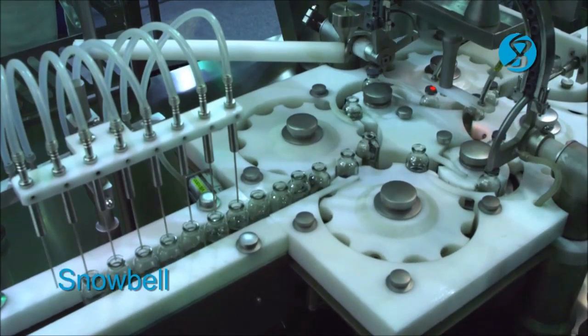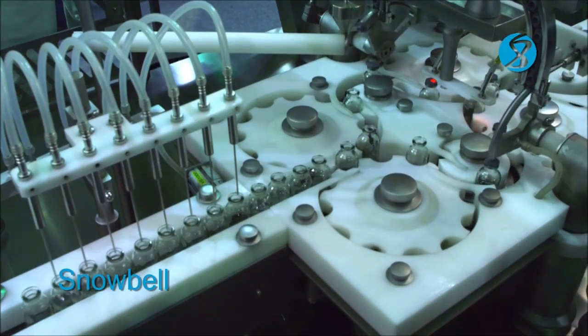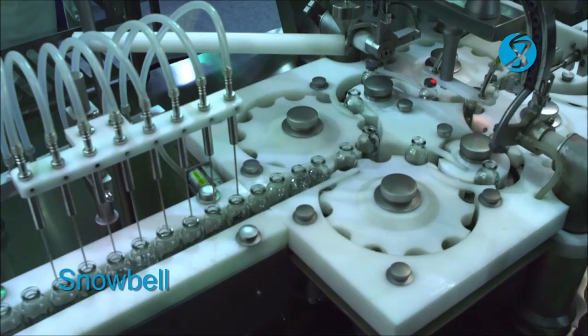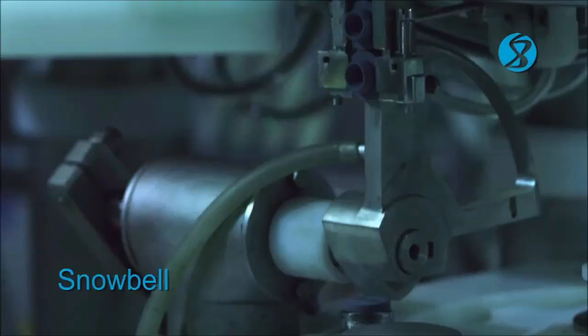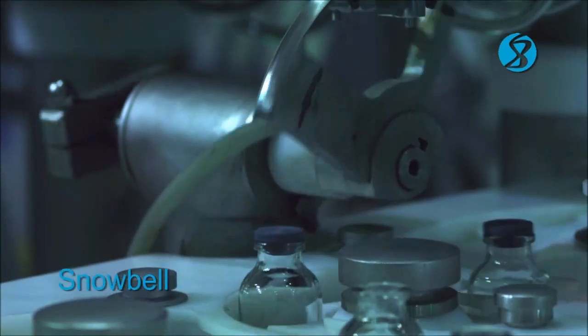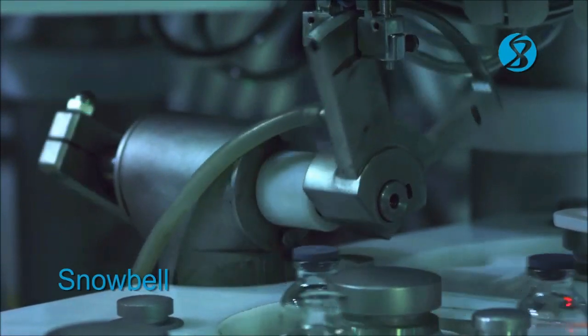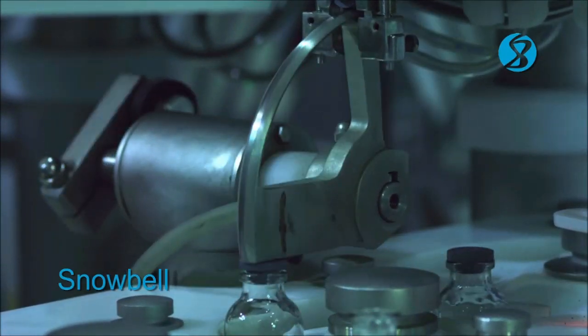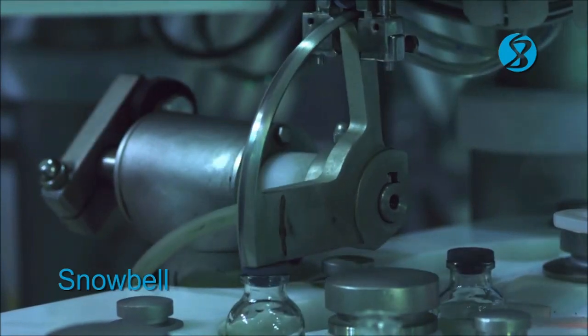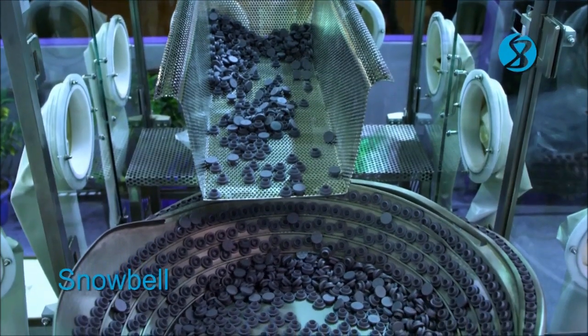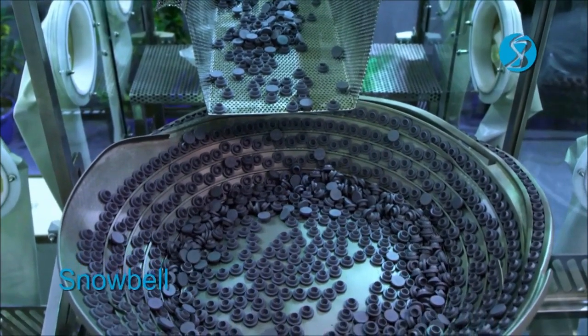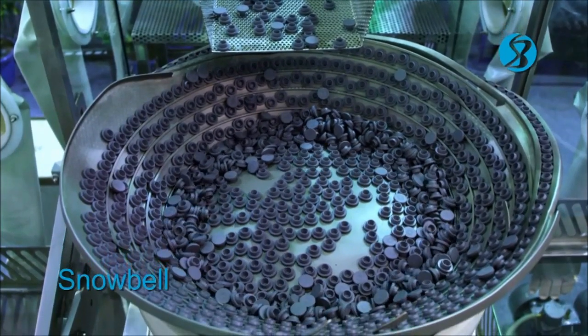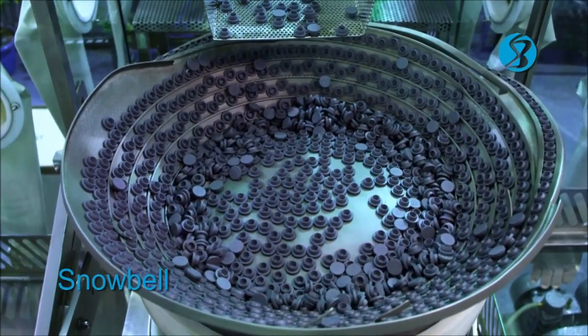Vials released from the dosing station are further indexed to the stoppering turret for stoppering operations. At the stoppering station, each vial is plugged by a stopper. Vibrating hopper orients the stoppers and delivers the stoppers on two tracks. Stoppers from each track are picked and placed on the orifice of the vials.